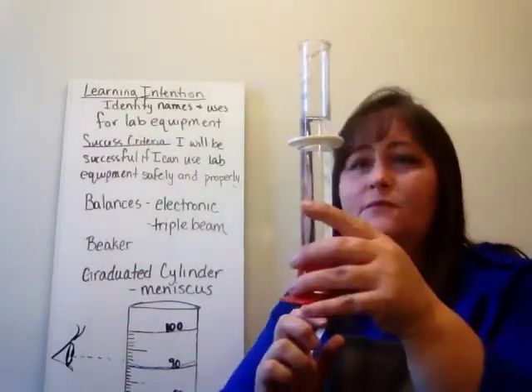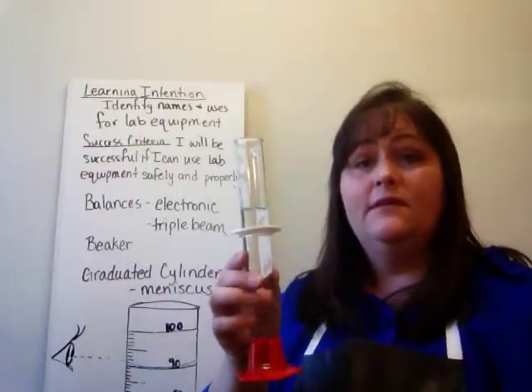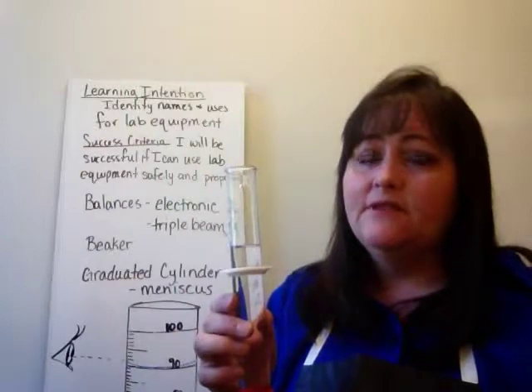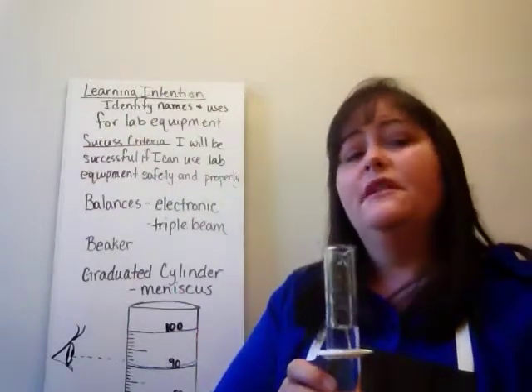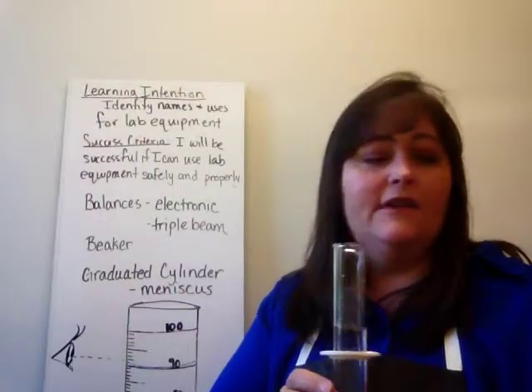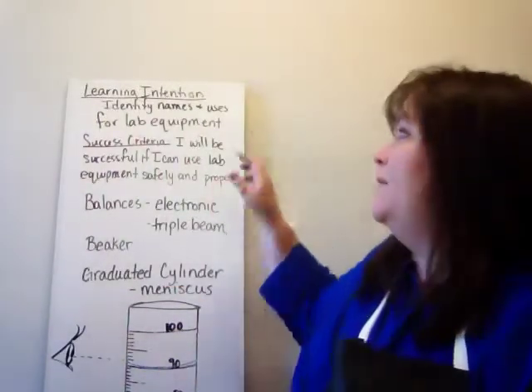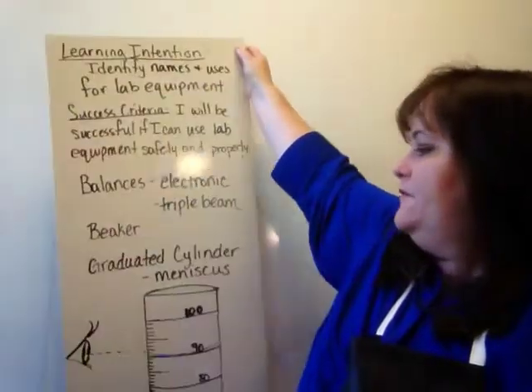If you were to read it from where the side of the water is, you'd say it was 91 milliliters, and that might not make a big difference in physical science lab, but if you were an actual chemist, it would make a big difference. You could have lots of error. So we've got to make sure we read a volume in the graduated cylinder from the bottom of the curve.